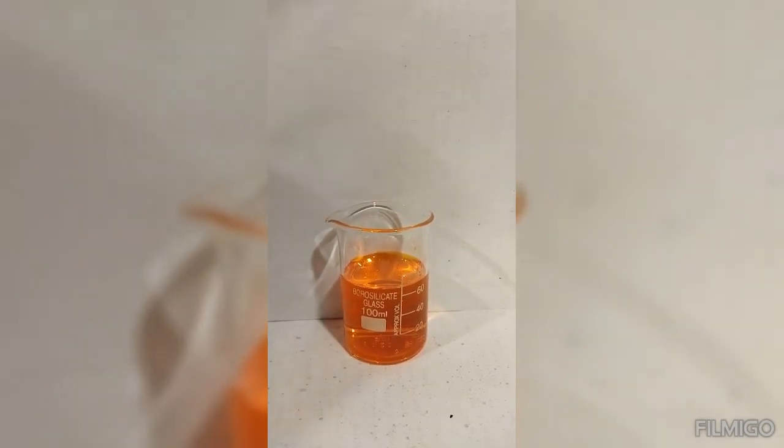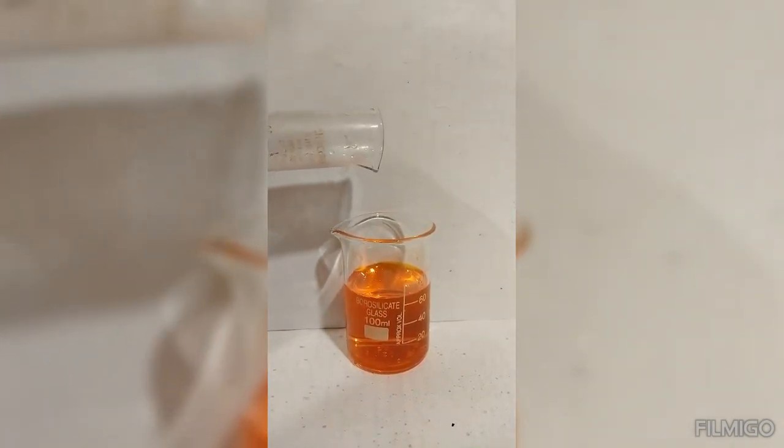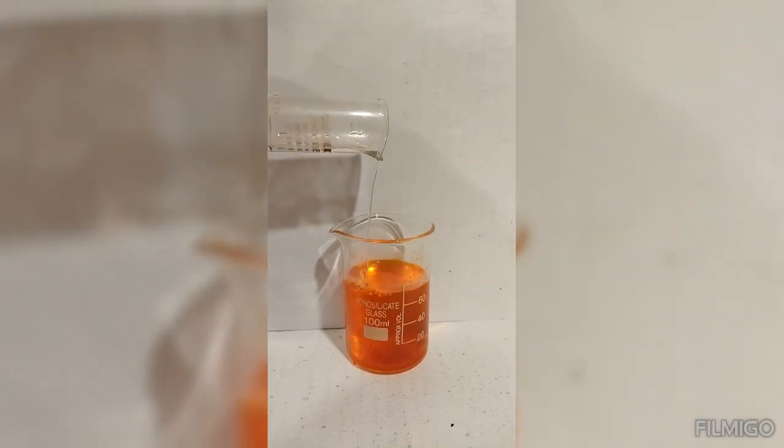Then, we add concentrated hydrochloric acid to the dichromate solution.